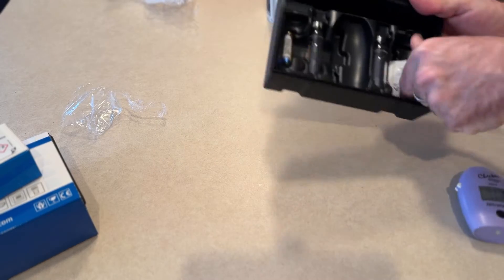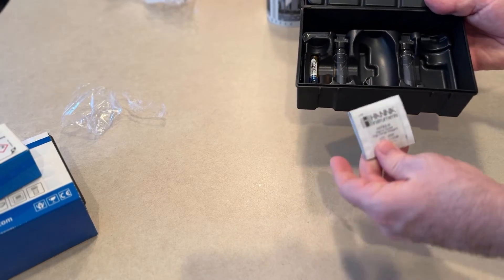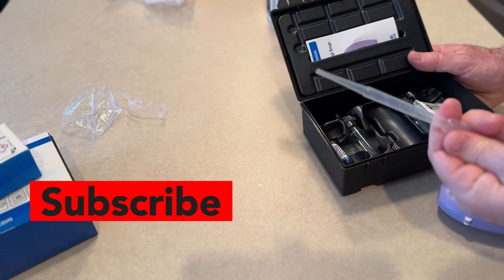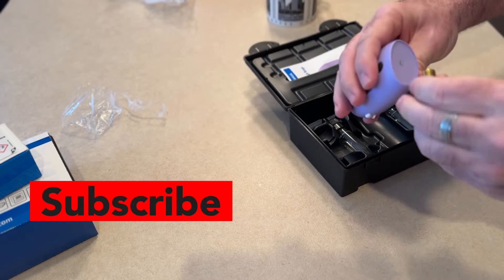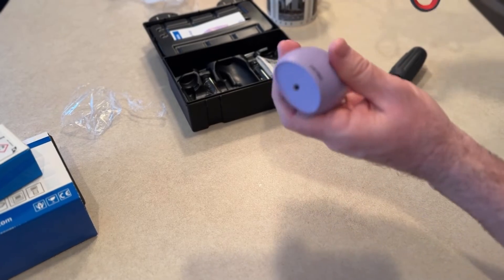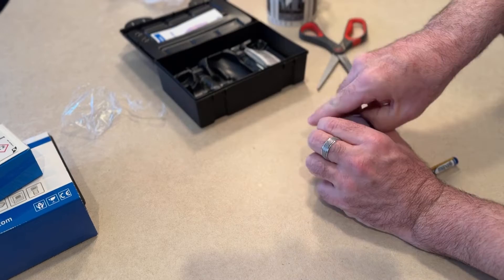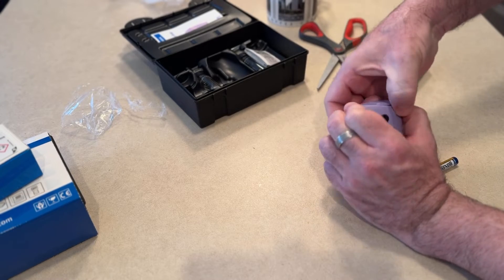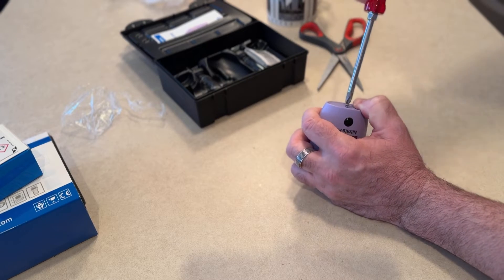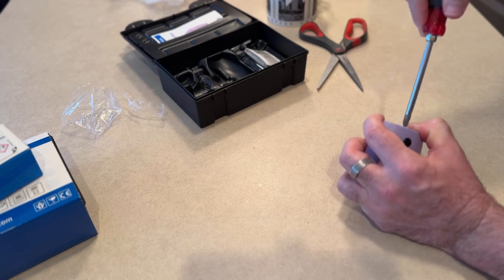It comes with the reagents — they expire in 2028 — and comes with two bottles. It comes with the water adder and a battery that you have to unscrew to put in. Once you unscrew the screw, you can't get the thing out — it's kind of stupid. And this screw doesn't want to go in straight today.